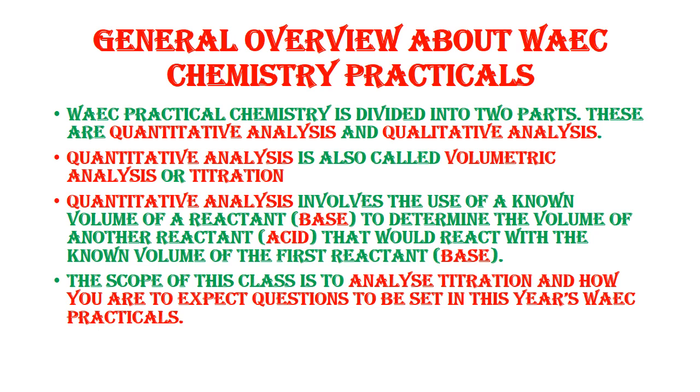The quantitative analysis, like I said before, is also called volumetric analysis or titration. It involves the use of a known volume of a reactant. One reactant, we know the volume. Then we want to determine the volume of the other reactant that will react with that particular volume of the reactant we know. You understand?